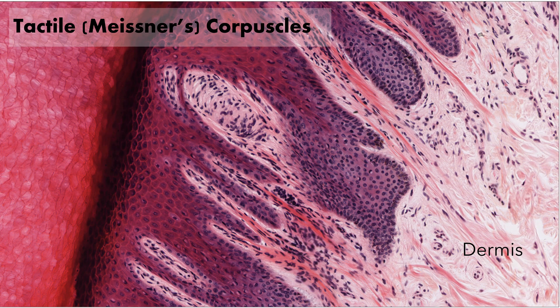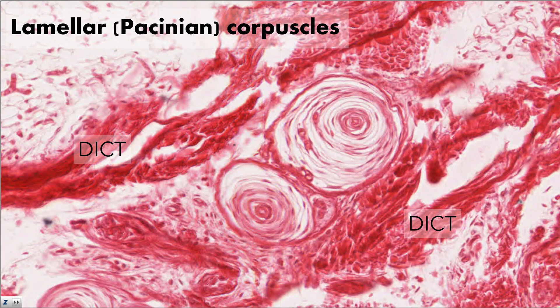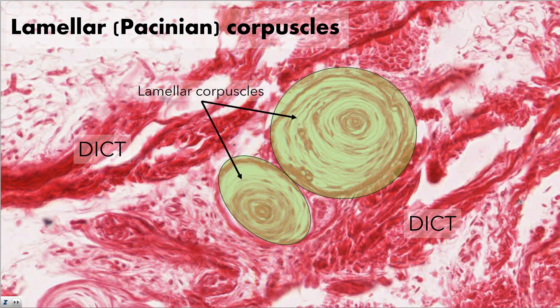Let's examine several nervous structures found in the integument. The first of these is the tactile or Meissner's corpuscle. Here we can see the dermis to the right and the stratum basale, stratum spinosum, and stratum granulosum to the left. Located in the dermal papillae throughout the body are tactile corpuscles. Tactile corpuscles have a twisted cone-like shape and are used for light touch. Lamellar or Pacinian corpuscles are located much deeper in the dermis — generally found in the reticular layer surrounded by dense irregular connective tissue. They have a look similar to that of a cut onion, with visible layers or lamellae surrounding the central stalk, which is the nerve ending. Lamellar corpuscles are used in sensing deep pressure, such as when someone pokes you.